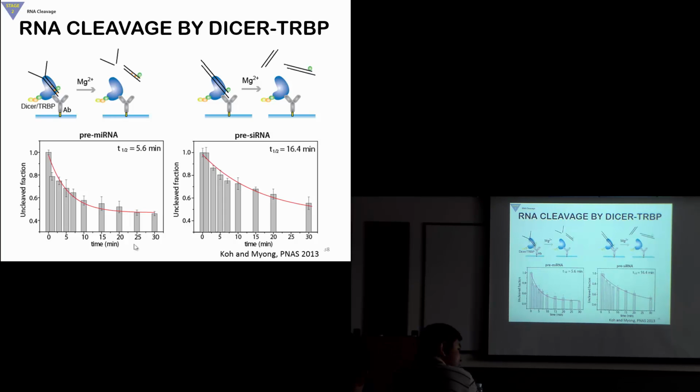Is there a reason why? Do you have any sort of distance between your regulated biochemical DNA and the surface? So the polymer is pretty mixed length. We could use a uniform length, but it didn't really matter, so there's not a set distance. In fact, we did some AFM imaging to look at the surface.